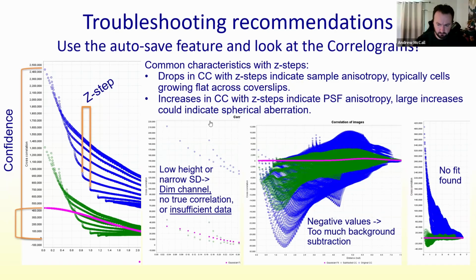You can't do distance analysis on it very well, especially if both structures are elongated, because all the distance analysis algorithms usually use a centroid. So if your object does not have a clear, well-defined center, it kind of ruins that. So CCC actually works really, really well with that data. Again, it broadens that distribution a little bit, but you still should get a good mean value.